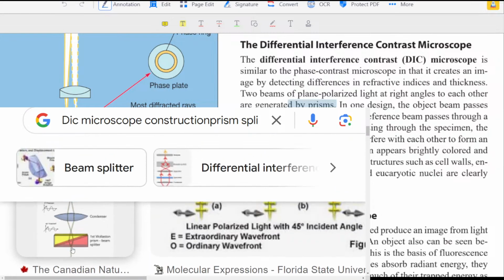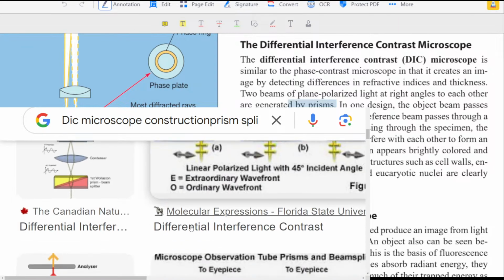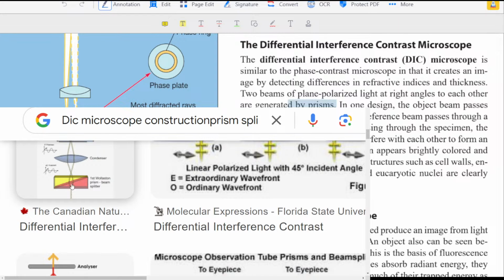If you see here, I think you can see the light generating, though this diagram didn't show it correctly. There was another diagram that showed the prism split the light at 90 degrees, and inside the prism it changes a little bit here and there. Well, prisms are of different types. And the wavelength became at right angle, you can say. Yeah, right angle is 90 degrees. Why is there already 45?